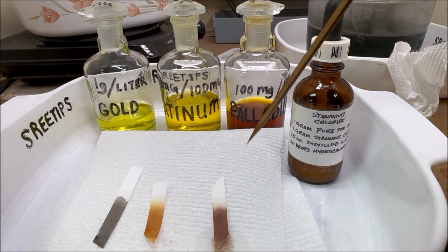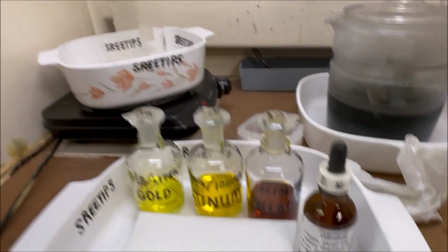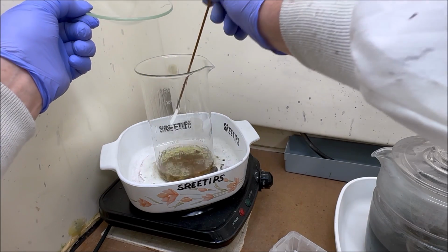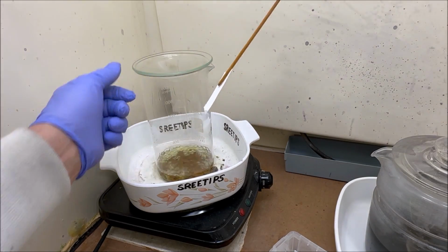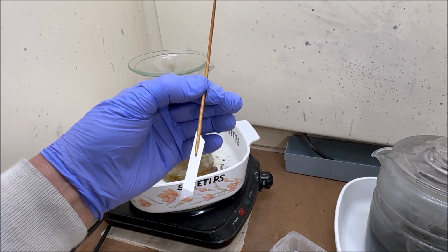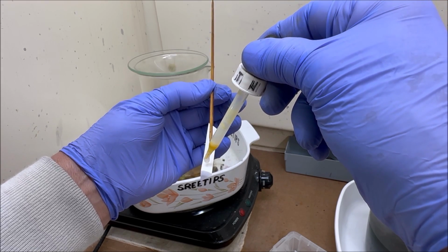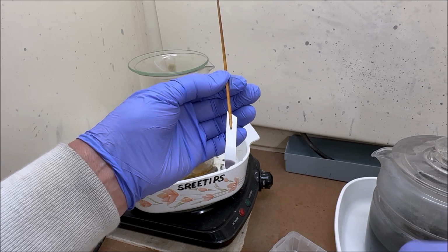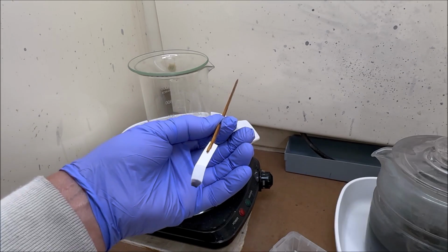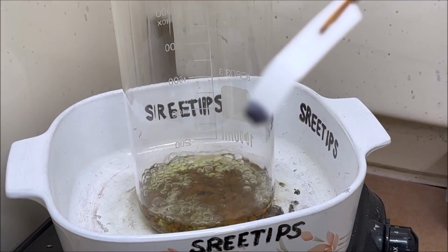Here are our test strips: palladium, platinum, and our gold standard test solutions. So now what we'll do is we'll reach down in here, get a little bit of the boiling solution. This is nitric acid. It's gold boiling in nitric acid. And what we're going to do, if I can get some test solution on here before it dissolves the paper, you can see that that has put gold in solution. So boiling nitric acid back here will put traces of gold in solution.